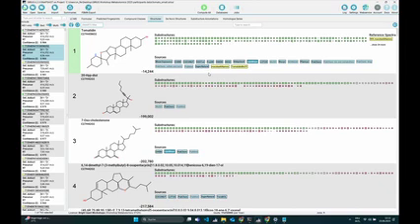And for the confidence score, we at least found in our evaluation in the COSMIC paper that a confidence above 0.6 corresponds to a false discovery rate of 10%. And there's also a plot that you can look at to get some rule of thumb.